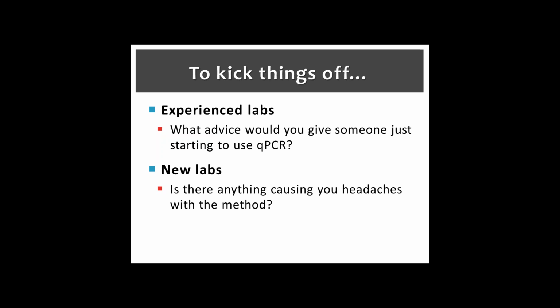It's good to have a 30-day geometric mean if you're in a long-term monitoring program. But as a swimmer, do I really care what the last 30 days of E. coli were? I don't care. I want to know right now, can I go swimming right now?